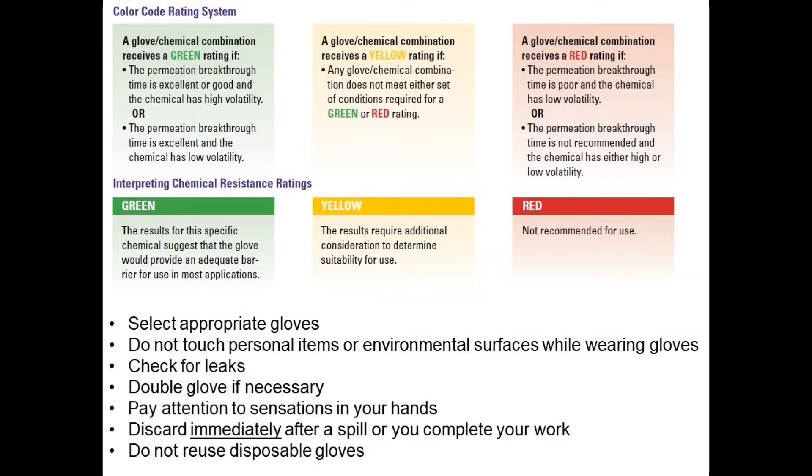Always ensure you select appropriate gloves. You can check glove compatibility charts available from vendors to select gloves appropriate for your materials. Never touch personal items or environmental surfaces. Check for leaks before beginning work. Always double glove if necessary — if you know you're going to get messy, wear two pairs of gloves. Pay attention to sensations in your hands and change gloves if you notice anything unusual. Discard them immediately after a spill or when you complete your work, and never reuse disposable gloves.